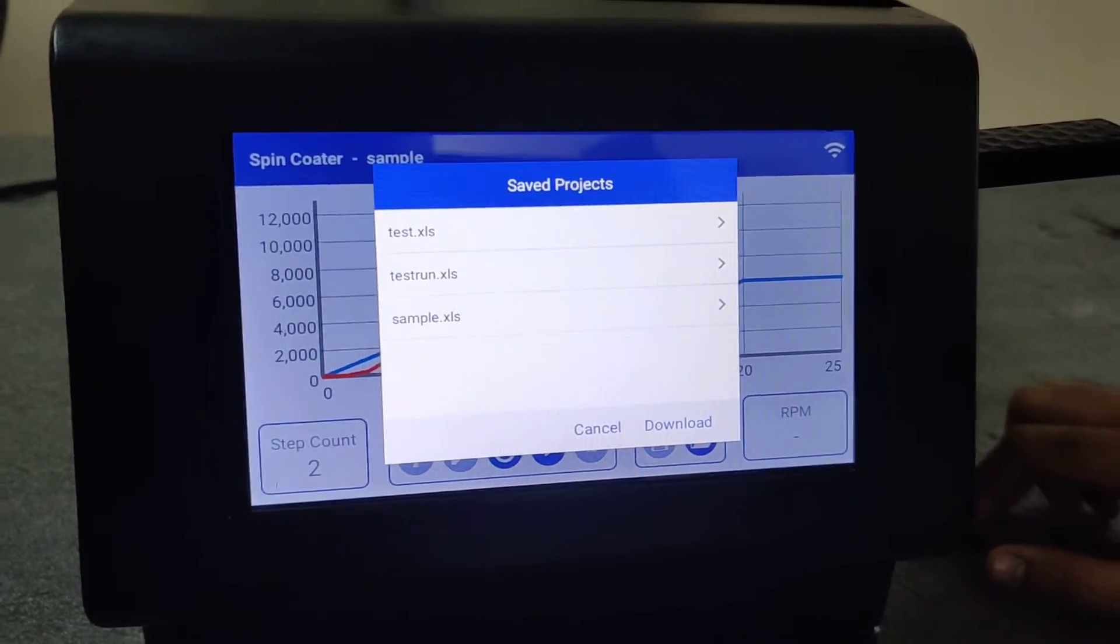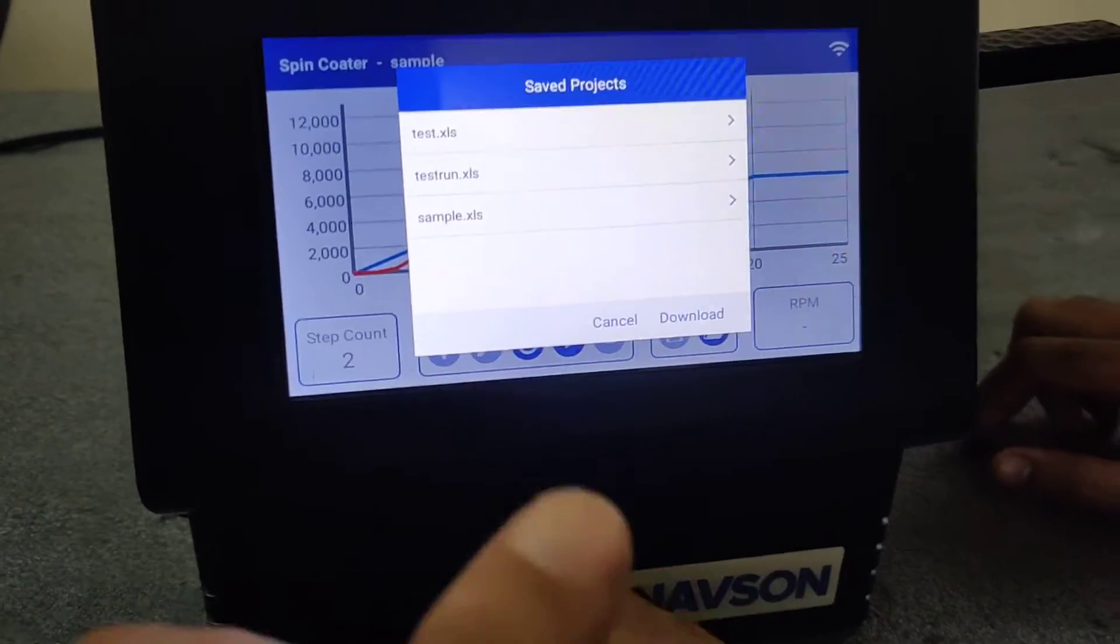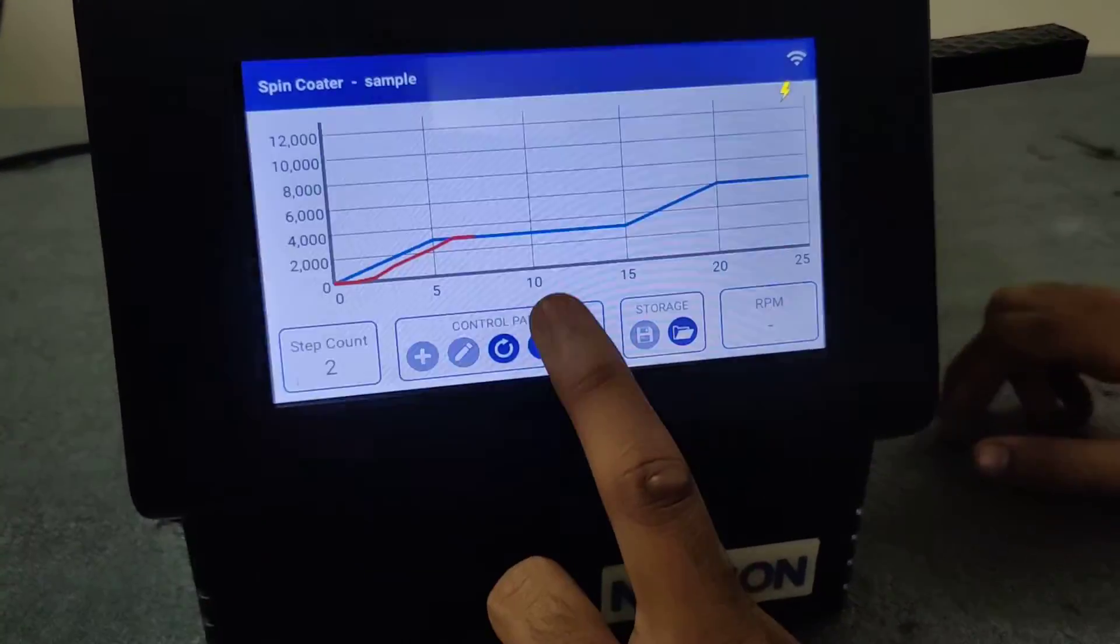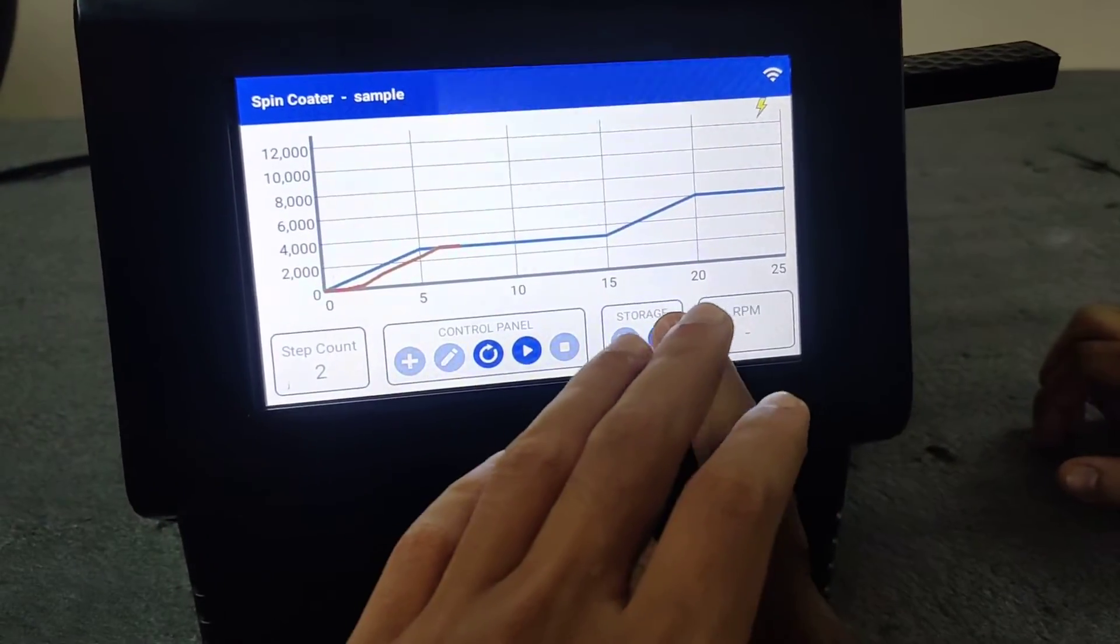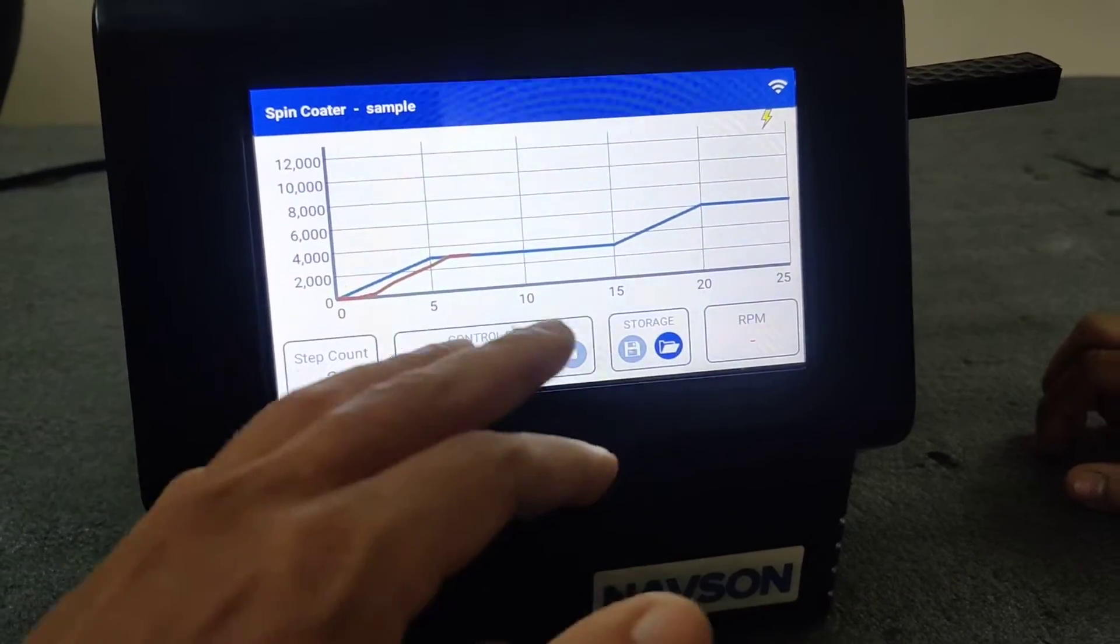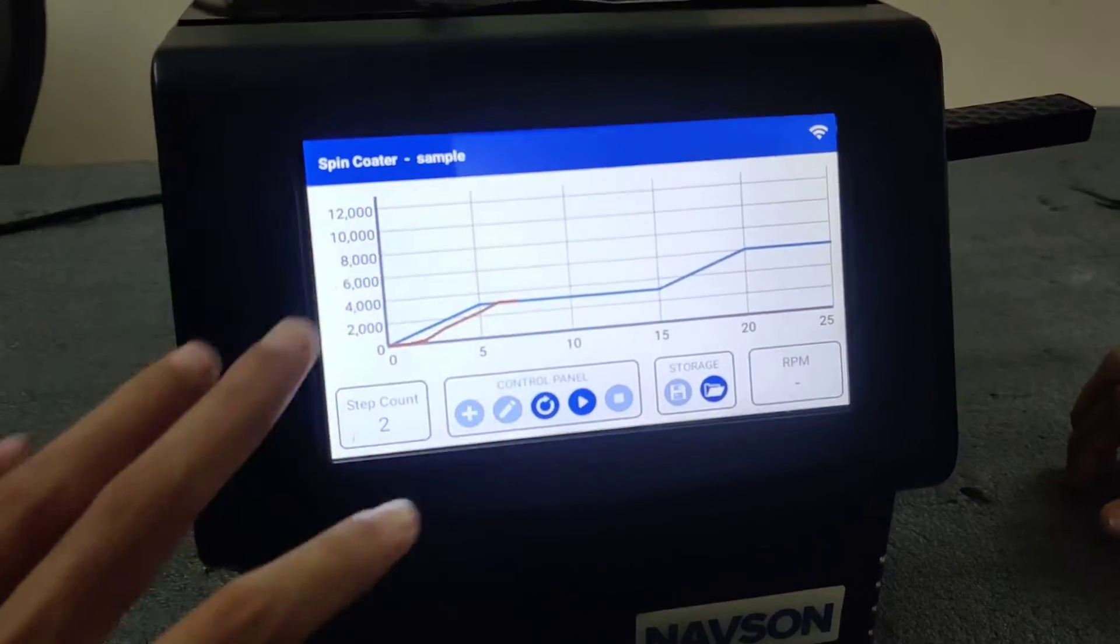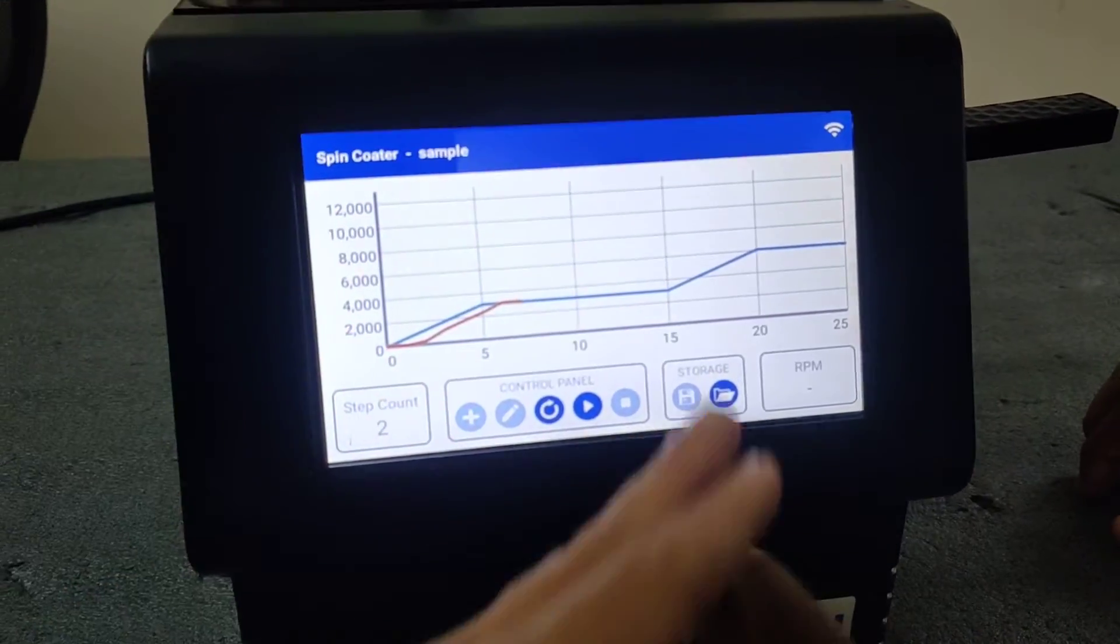Cancel. So now we will see like you need to delete this sample from this system. Internal, delete, delete, delete. You deleted it.